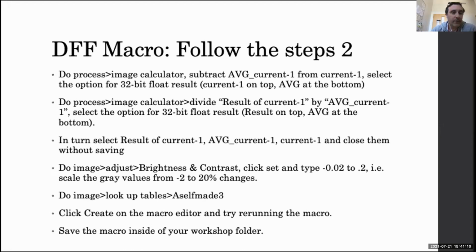Yeah, these are really just the intermediates that you're getting as you do the calculation. So they could be saved if you really wanted to go back and examine them, but for the purpose of this macro, it was mainly for checking the quality of the data, so I could assess that from the final DFF, so I did not look at the intermediates very carefully or save them, since it would take an equal amount of disk space as the data itself.